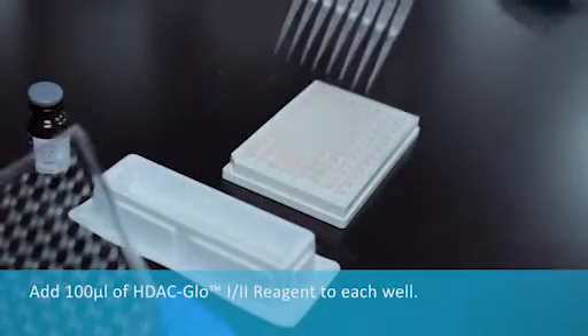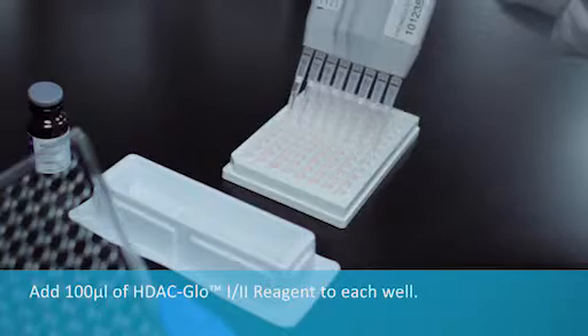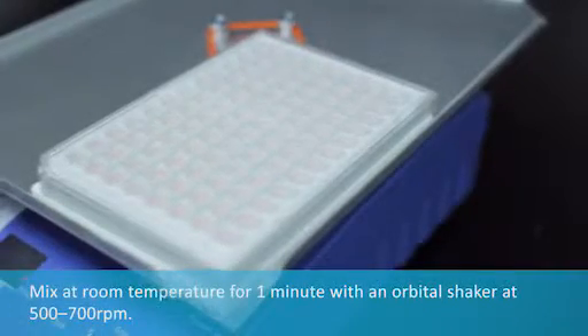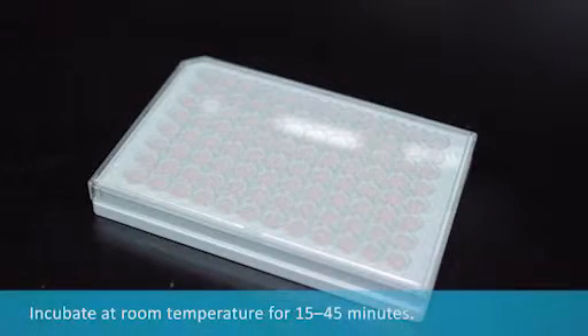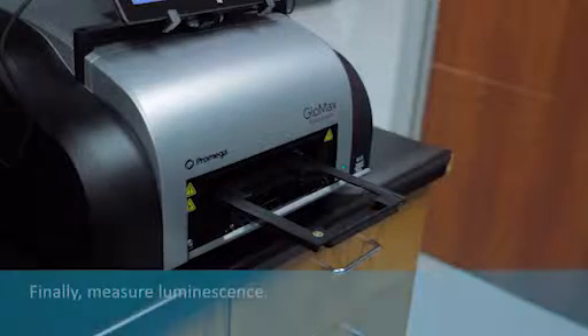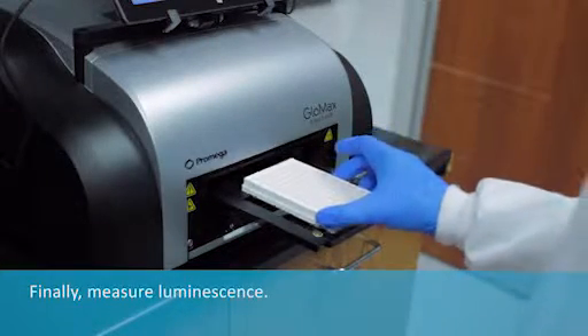Add HDAC Glow 1-2 reagent to each well of the plate. Mix at room temperature for one minute with an orbital shaker at 500 to 700 RPM. Incubate at room temperature for 15 to 45 minutes. Finally, measure luminescence.